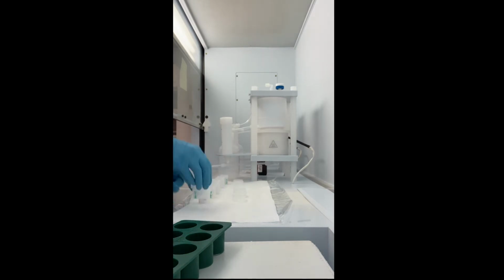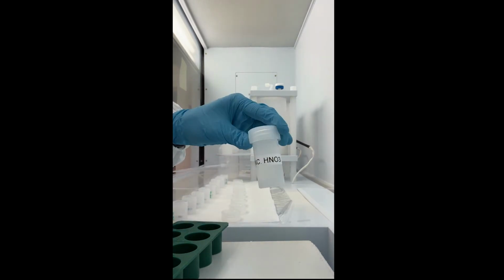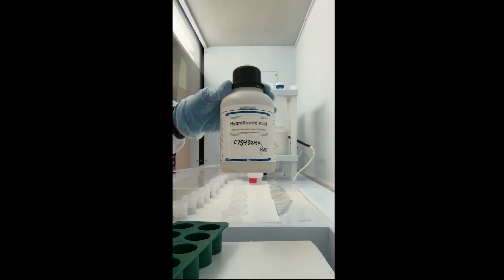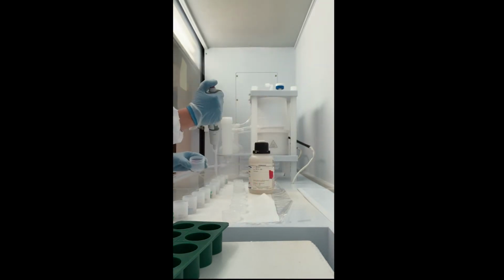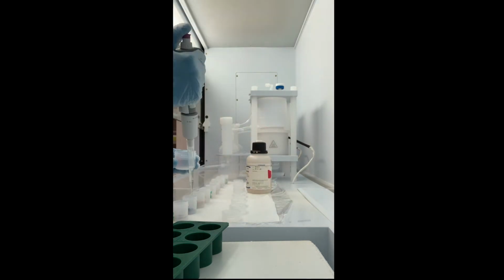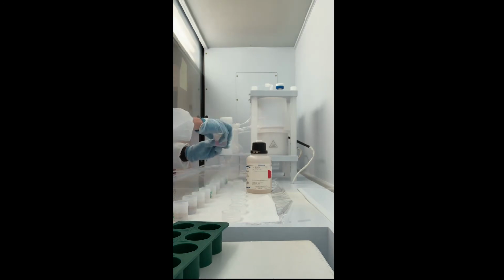So the next step is to start what we call the dissolution process. This is where we use a mixture of acids to actually break down a solid rock into a solution, which is absolutely crazy. We're able to take something that is very difficult to break, even with a hammer, and completely dissolve it into something that we then can put through columns, which you'll see in just a minute, and ultimately measure different element concentrations out of it. So this is an incredibly, incredibly neat experience, and something that I personally enjoy, even though I've been doing it for years now.